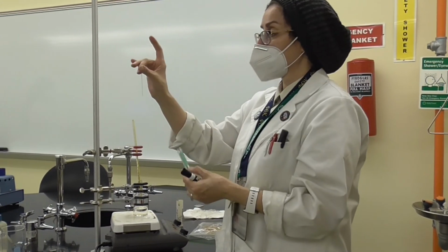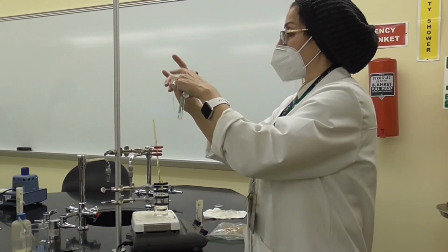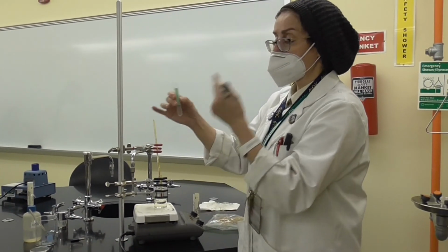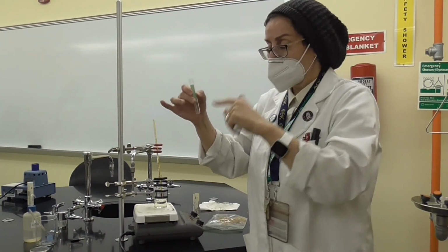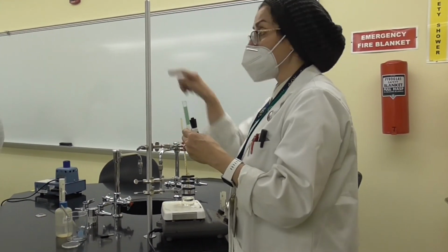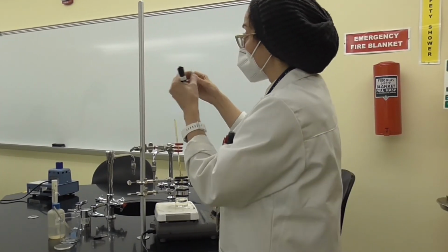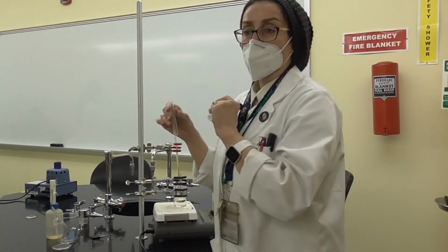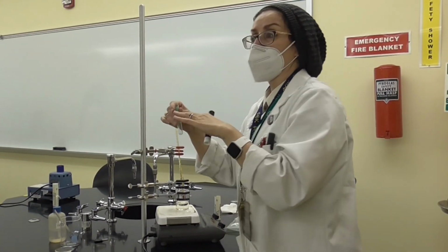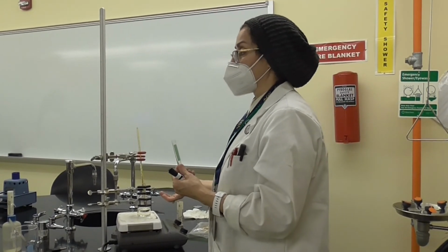The capillary tube should have the open end down and the closed end at the top. So how are we going to observe? The minute it starts boiling, that's when you record your boiling point, and you're going to see the liquid go inside the capillary tube, the small tube, okay? That's when we reach the boiling point. So this is how we are going to measure the boiling point.